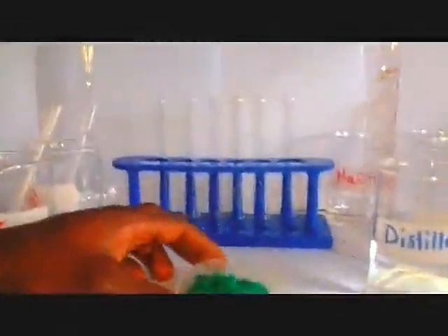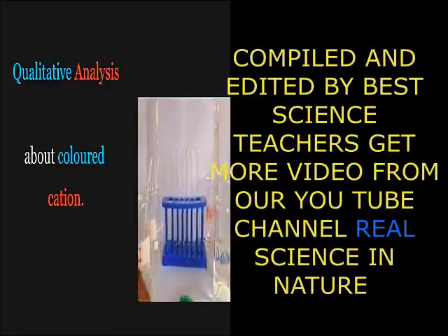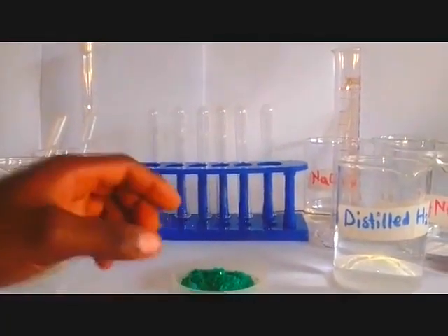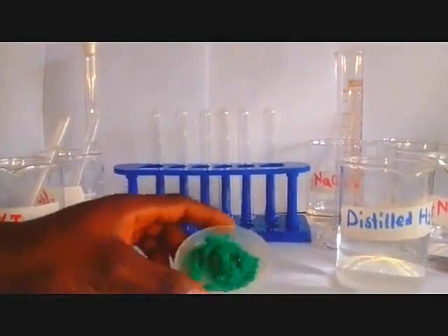Guys, we are going to look at qualitative analysis. Remember, in chemistry we have quantitative and qualitative analysis, but in qualitative we are only interested in presence, so we are only confirming whether it's there or not. So we have our sample here.